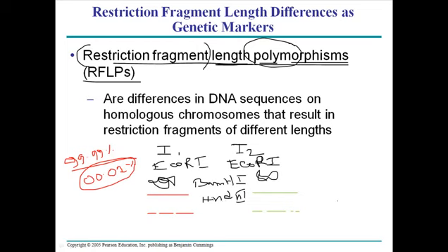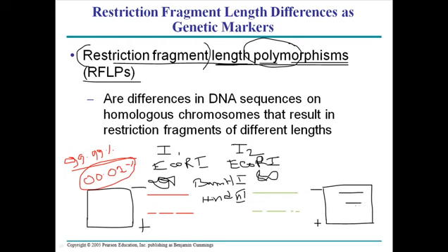That's how we can find it in this electrophoresis. So in the blot of our electrophoresis, for example this is for individual 2 and this is for individual 1, if we run this electrophoresis here, this is minus, this is plus. After running it, we found this is a big part, a smaller one, another smaller and smaller. So we find 4 segments in 4 different length places, and in this case almost this range, another is this range. That will be the dissimilarities between their DNA structures. We call them restriction fragment length polymorphisms, or RFLPs.